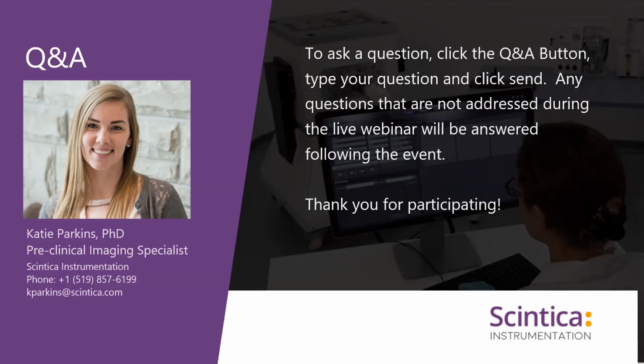I just wanted to cover one really quick question, and we'll get back to people and expand the answers as needed. So one final question before we reach the top of the hour. Katie, you talked about ex vivo imaging, and is it possible to do this with bioluminescence imaging? And if so, expanding on what you'd already said before, how does doing ex vivo imaging really help to improve the issues of limited depth of penetration with optical imaging technologies?